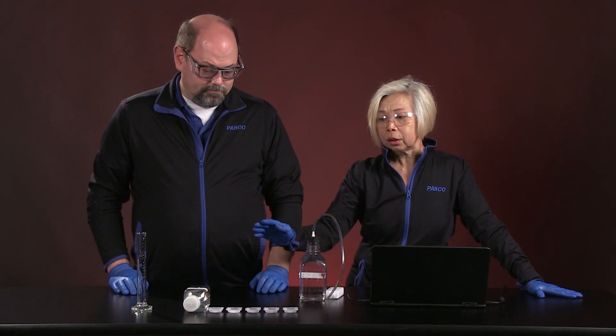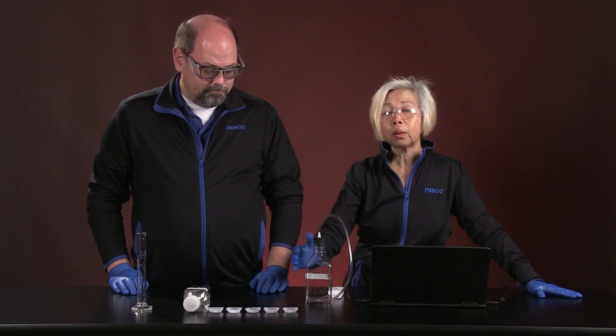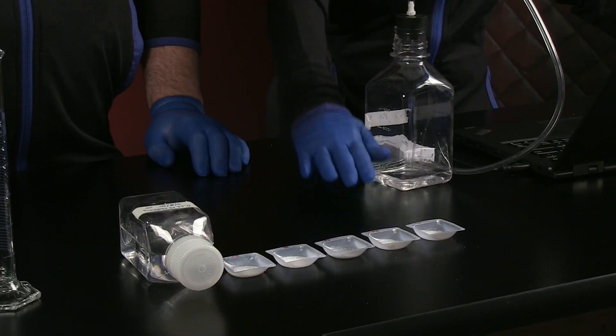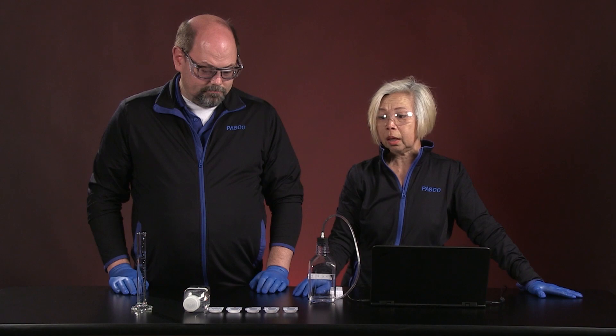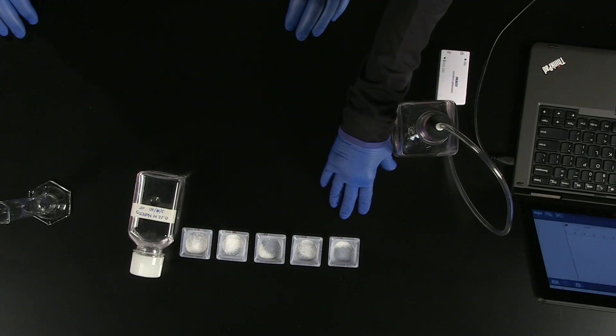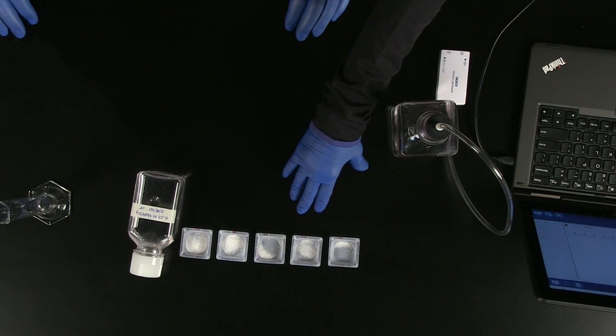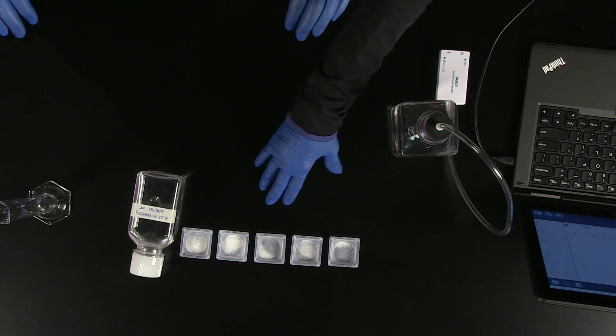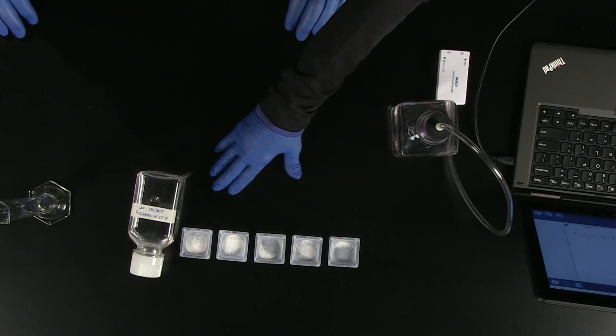We will be adding to each of these runs, we will be adding citric acid. And the citric acid that we have today has been massed at different levels. We have 0.1 gram, 0.2 gram, 0.3, 0.4, and 0.5.